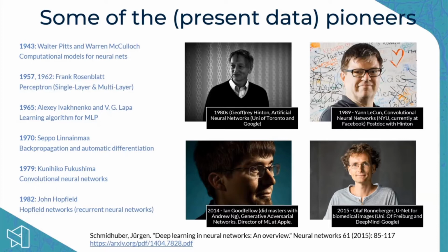And so there is a little bit of an arms race between the generator and the discriminator in order to get ever more realistic images. So this has also been expanded in the life science space in microscopy with a type of network called CycleGAN that has been shown in a few publications in recent years.